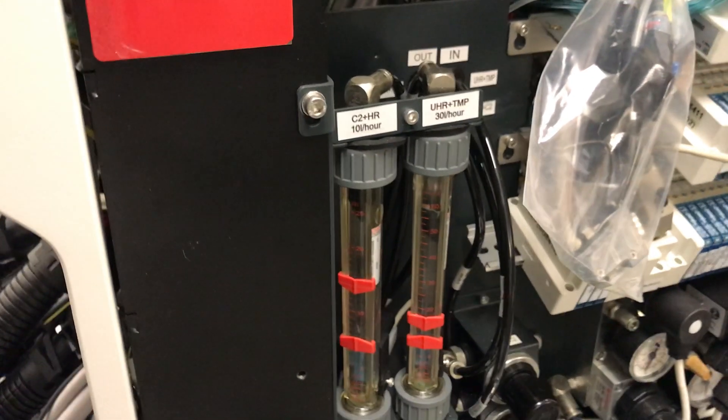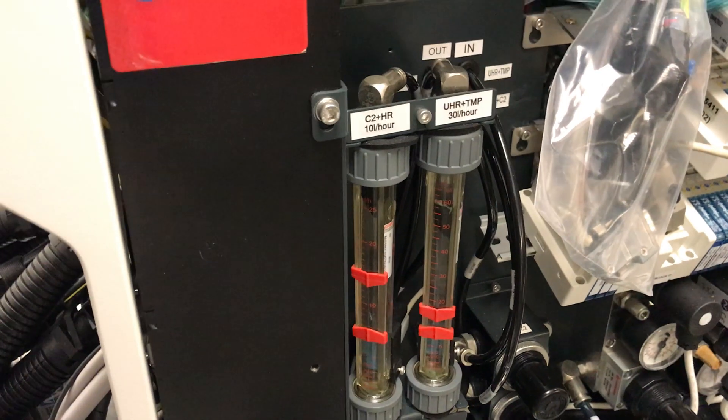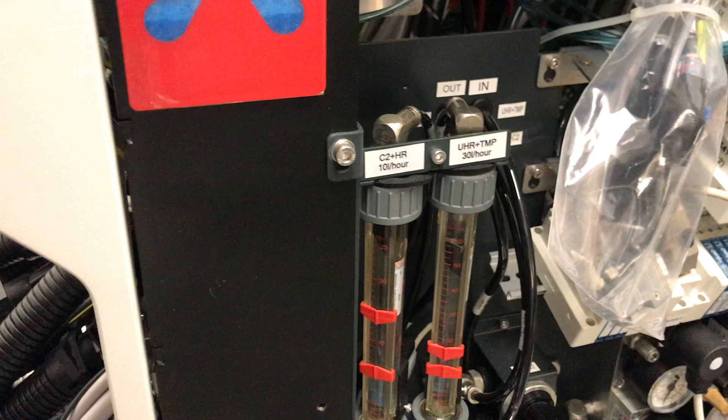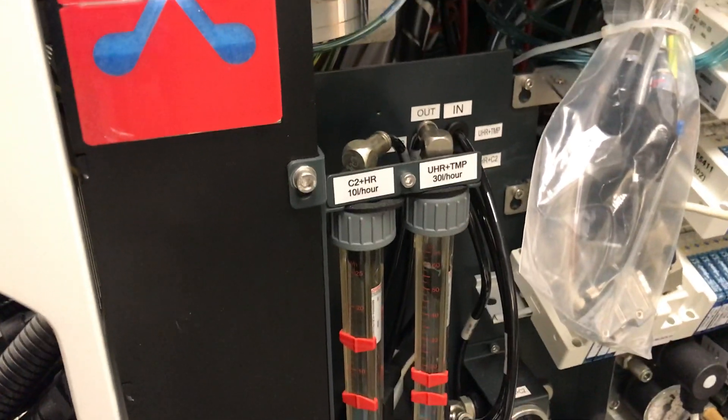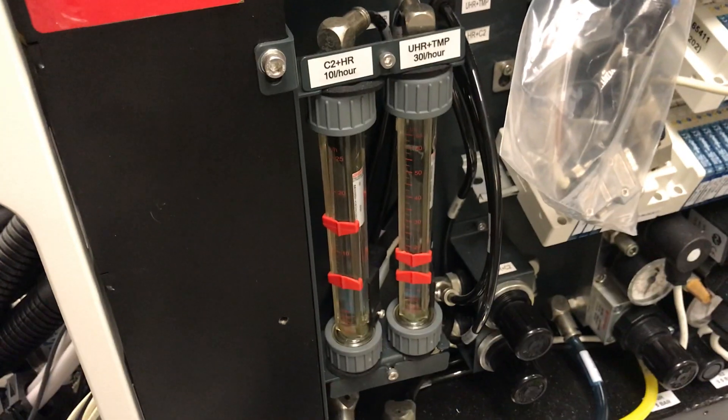So there's an optimal level. Another way to think of it is: you need to set the flow as low as you can while the chiller can still conduct heat away. That's kinetics 101 — faster moving water is more effective at removing heat than slower water.